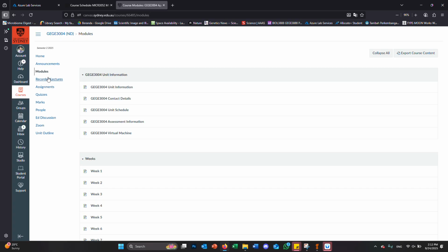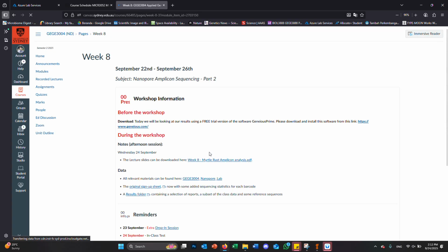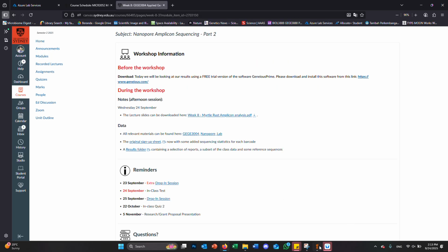As they pass through this membrane, they will trigger a change in the current, and each base gives this characteristic change. And once that has been recorded by the MinKnow software, which the laptop had installed, it recorded the current. There's actually another pretty high performing software that needs to convert those signals into nucleotide bases and give us some quality information about them.